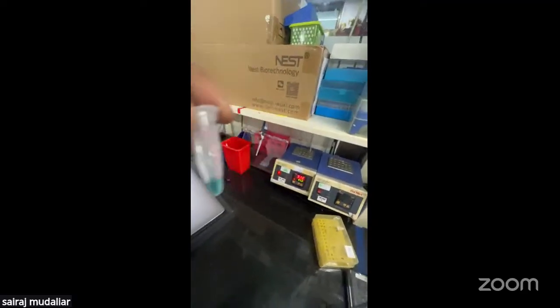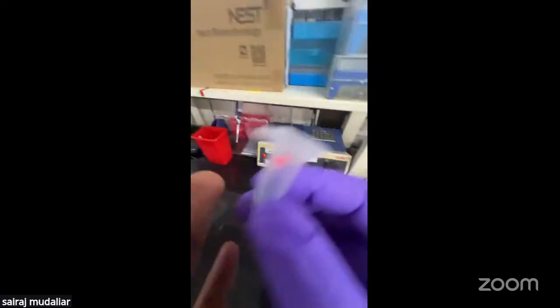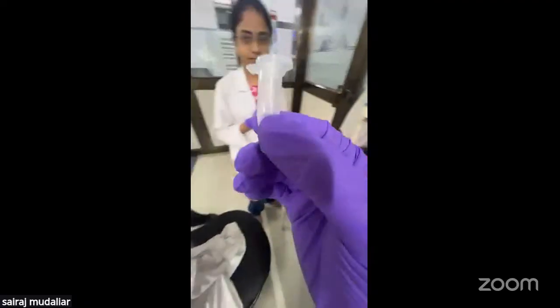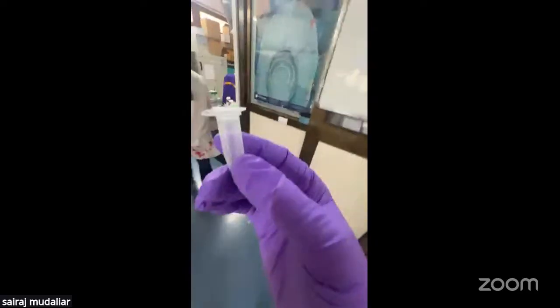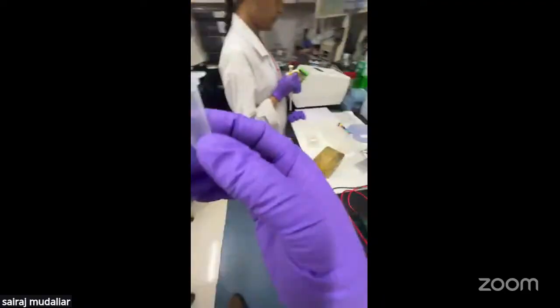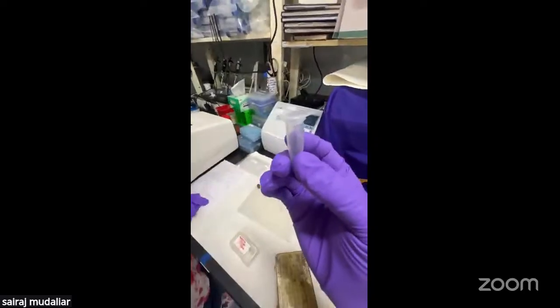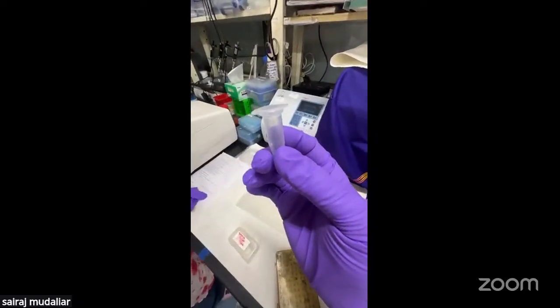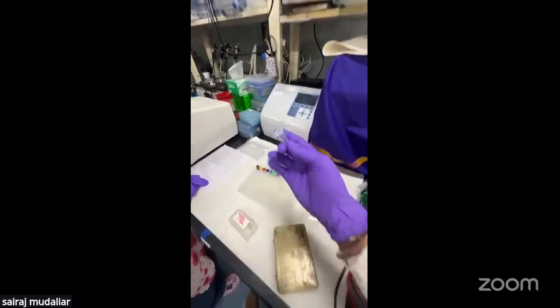The main logic here is that once the reduction is done by the TCEP, we prevent the proteins from refolding by doing the alkylation. Once the reduction and the alkylation are done, it makes a way for the enzyme trypsin to enter into the proteins and perform the digestion.